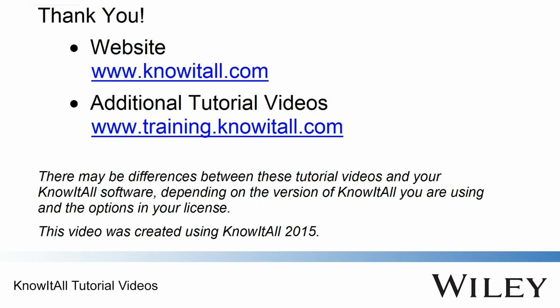This concludes our demonstration of how administrators set up the KNOWITALL QC Expert application.